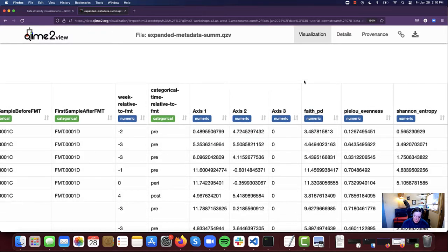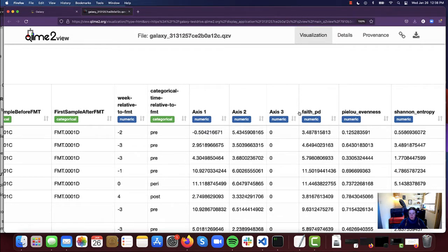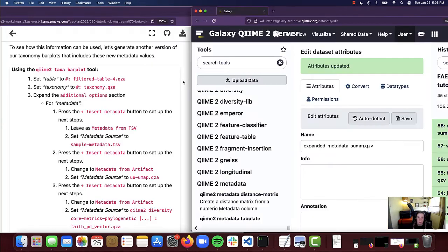You'll notice that axis three is filled with zeros. The reason for that is because we only calculated two dimensions for our UMAP instead of three — if you would like to explore calculating this in three dimensions, you're welcome and encouraged to do so on your own time. We also have our Faith's PD, the evenness vector, and the Shannon vector. To see how this information can be used, we're going to generate another version of our taxonomy bar plots from earlier in the workshop that will include these new metadata values.